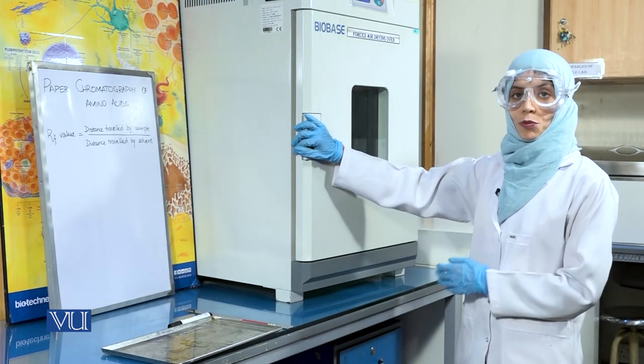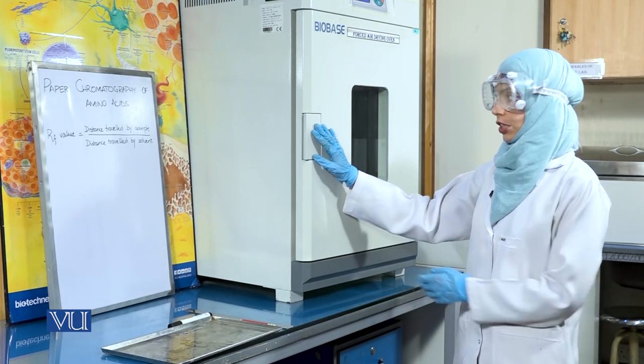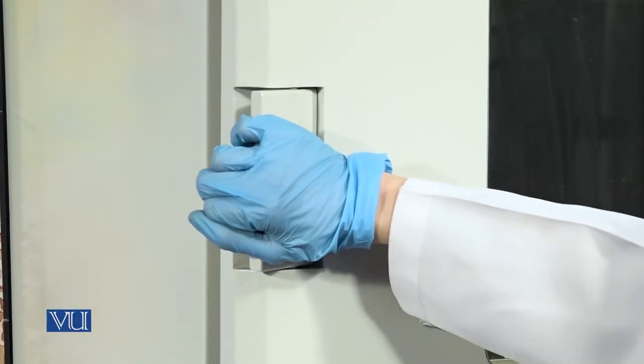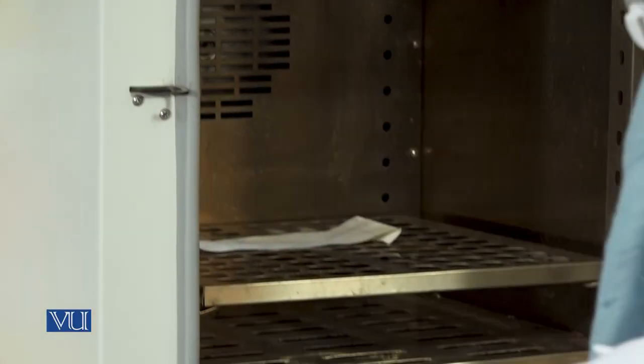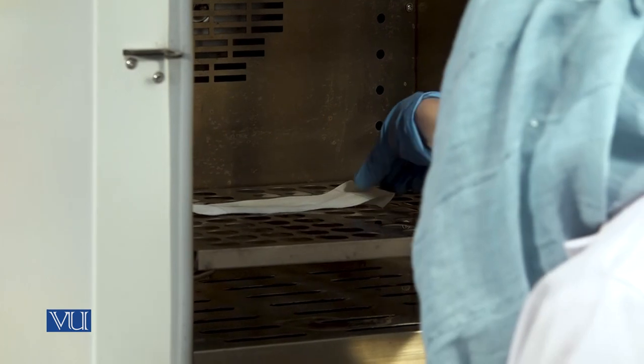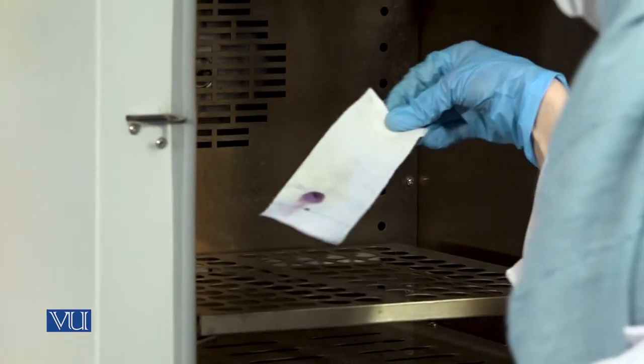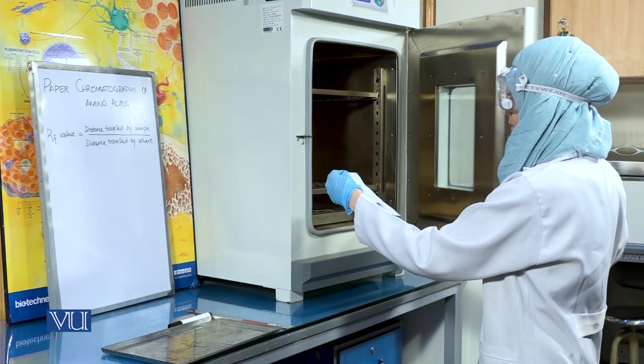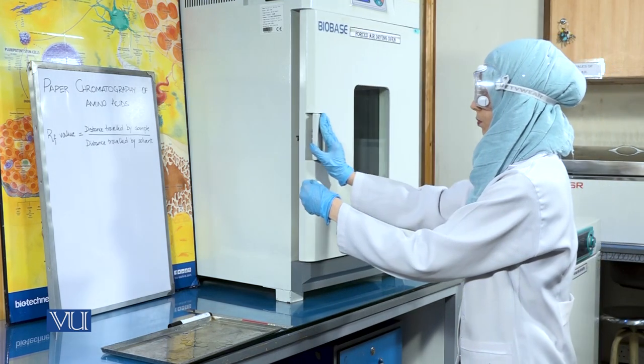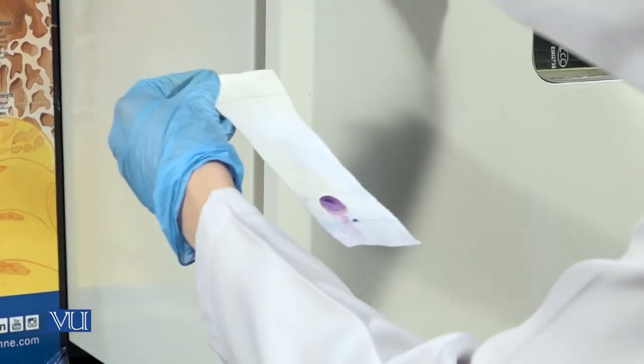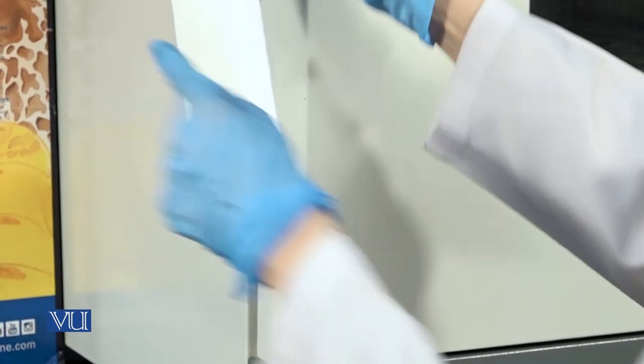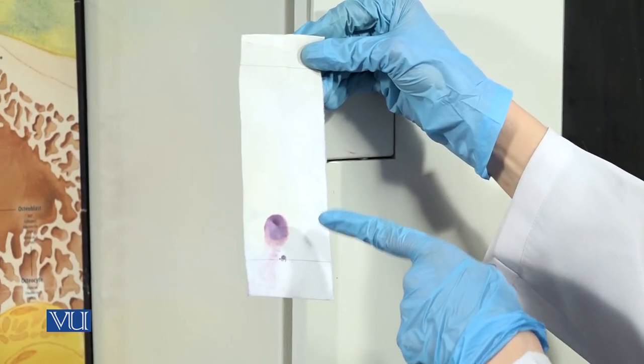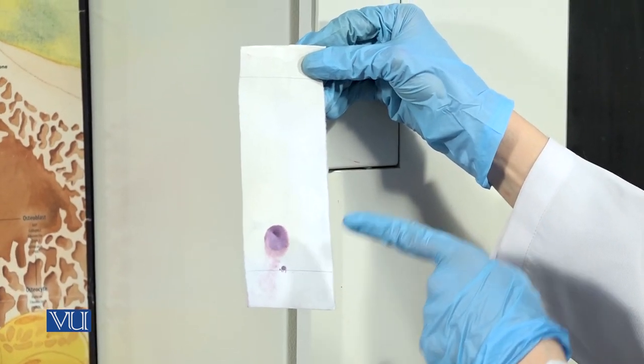After five minutes, we will remove this chromatogram from the oven. You will be able to clearly see the spot of the amino acid on the chromatogram.